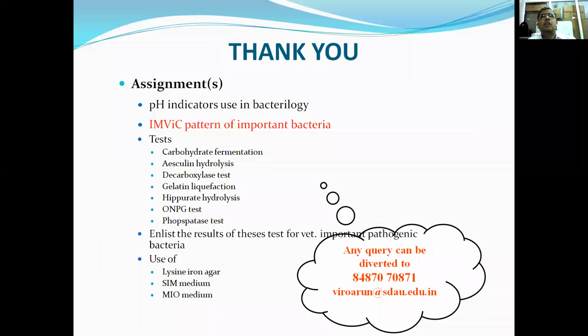There are 3 or 4 or maximum 5 pH indicators generally used. So that table you have to prepare and share. And second important, that is the IMViC pattern of Enterobacteriaceae. I have highlighted this because it may be asked in your exam too. That's why you have to find out and remember the IMViC pattern of important Enterobacteriaceae family.